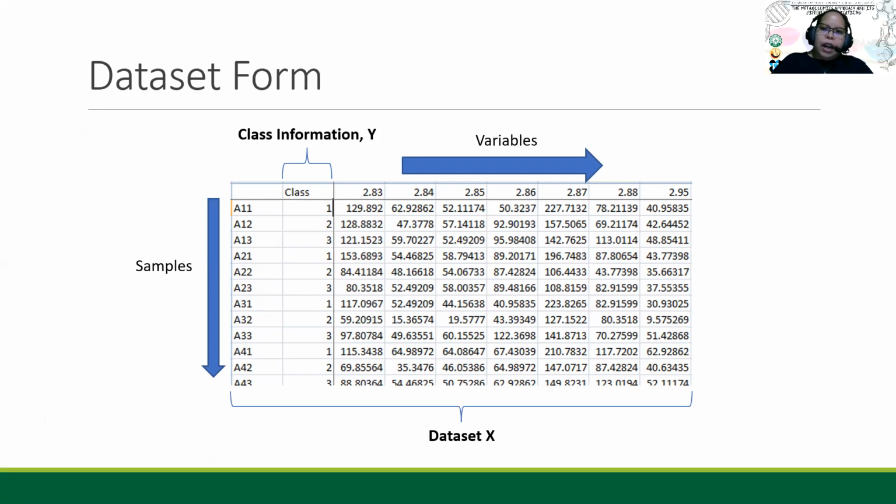So you can make use of that. In terms of LCMS or GCMS data, this will be your MZ at a particular retention time. So remember, three-dimensional yung data that is obtained using MS. So each MZ can have peaks at different retention times. So you need to define for each variable what is the MZ value as well as the retention time.